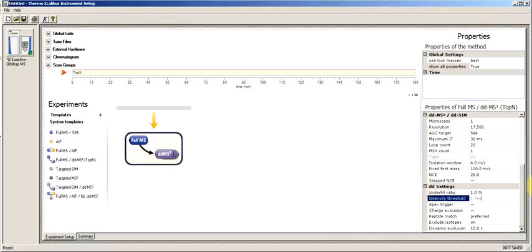If I have 1.7 E4 ions, that's going to give me a pretty good fragmentation spectra. And so really between this and the AGC target, this determines the intensity of your MS-MS spectra. And the parent going in is going to be between 1.7 E4 and 5 E4. So this is a nice range. I think you're going to get pretty good fragmentation spectra from this, depending on how much you load and how many fractionation steps there are for your sample.